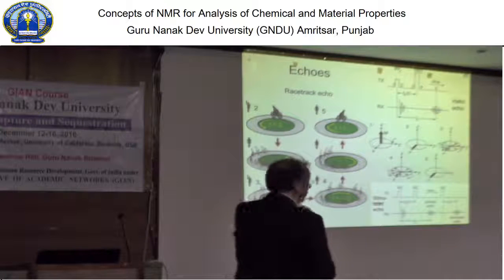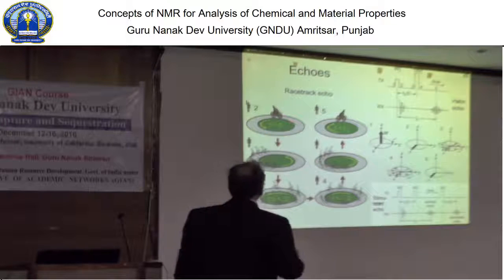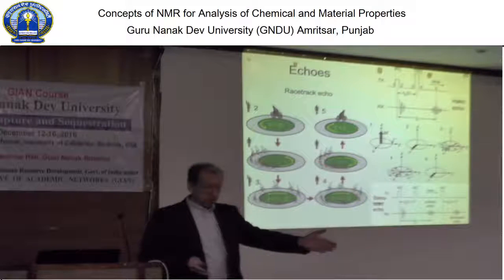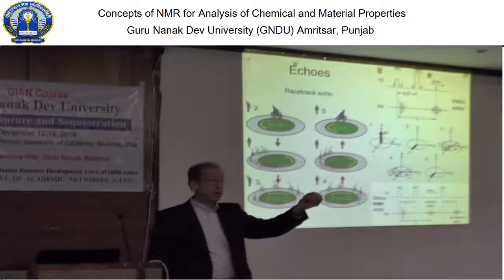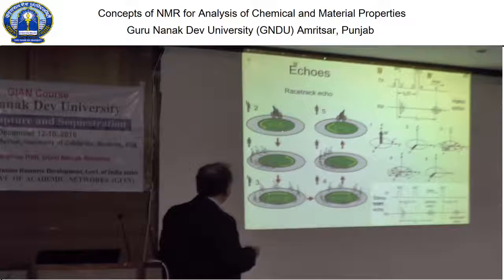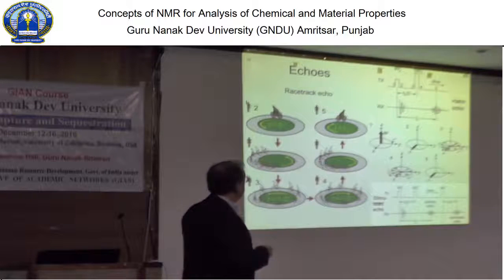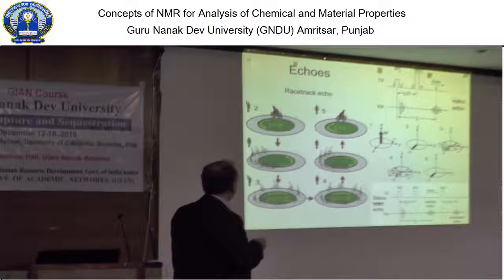So, we go back to bicycle riders. I like to ride a bicycle. Suppose these are the different magnetization components, it could be chemical shift, or it could be different positions of your solute in the sample tube, where the magnetic field is slightly different. So each of them points to one of the bicycle riders, different magnetization components. And then you do the 90-degree pulse, and that means you tell the bicycle riders to start their race around the circle.